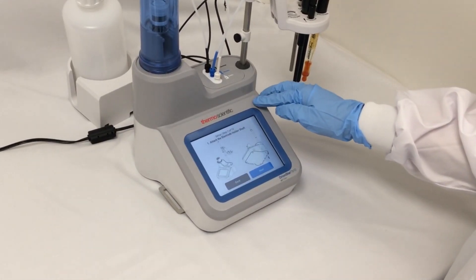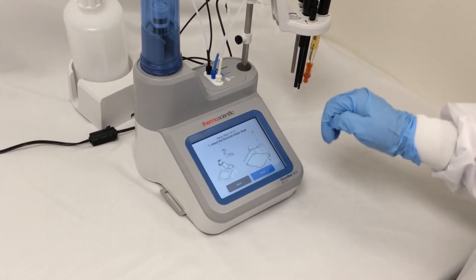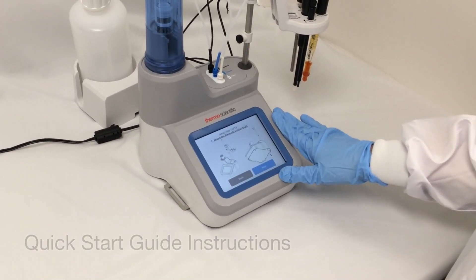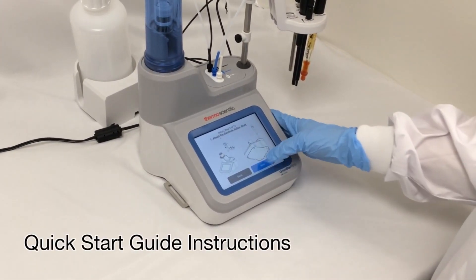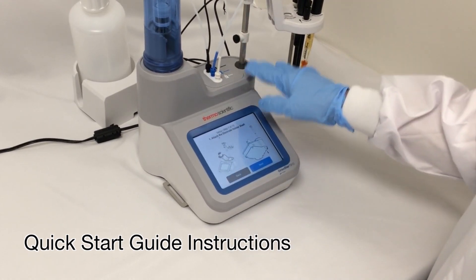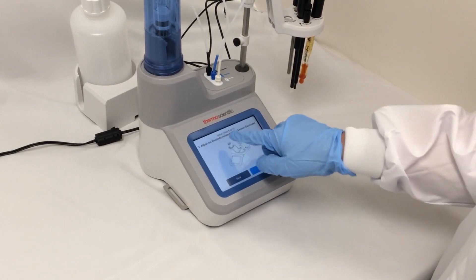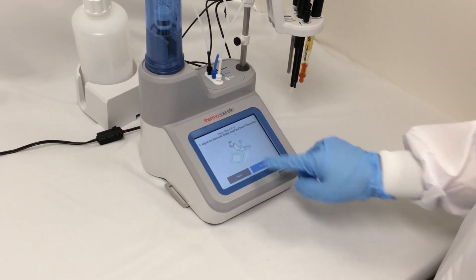Now my titrator is going to show me the setup parameters. If I powered my titrator on first, I'm going to see the same instructions from the quick start guide on my screen. I can also use this to verify that I've done everything properly before I start titrating.